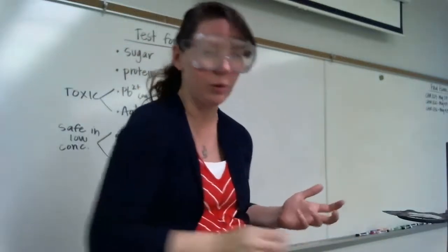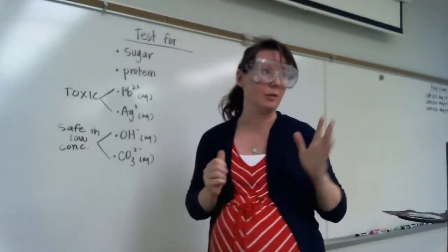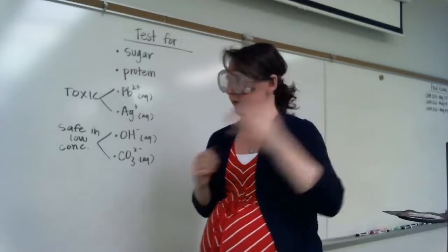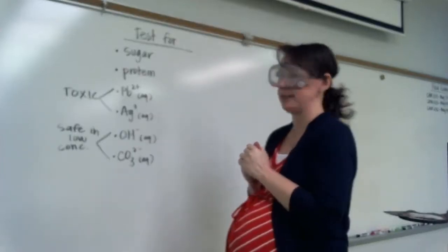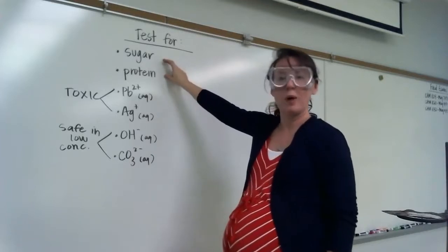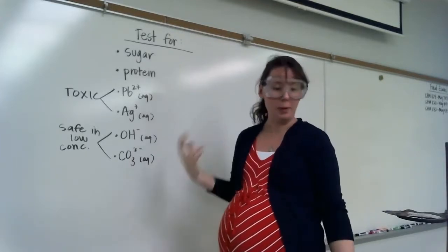And we want to know what's in our campus water. Specifically, not water from our faucet, because that's processed by the city. What's in our drainage pond out there? So we're going to be testing today for several different things. We're going to be testing for sugar and protein. Why would those be things that you would expect to have in a pond?